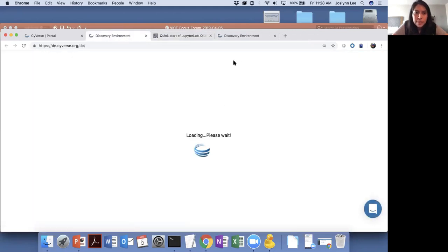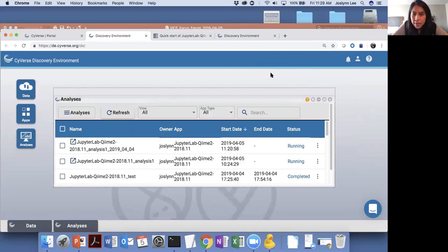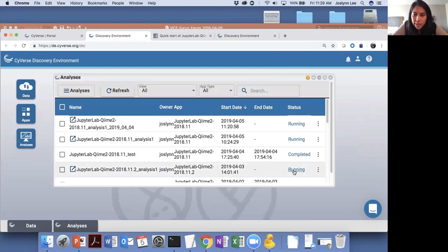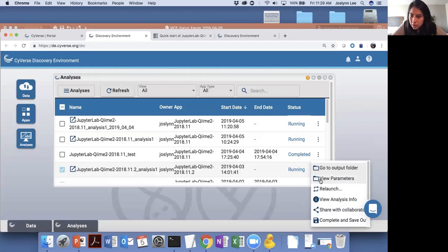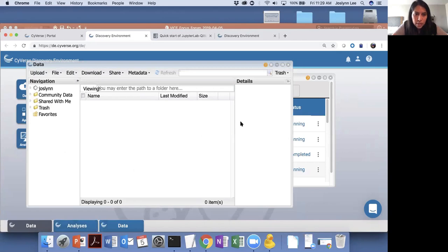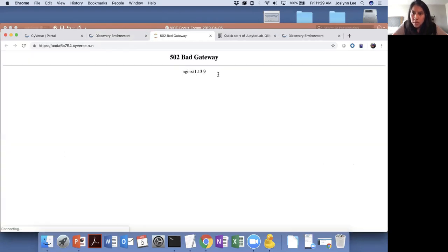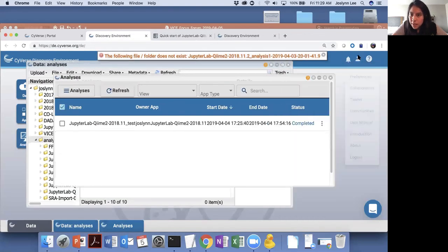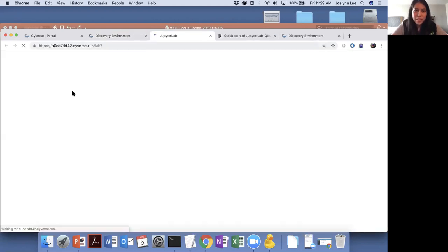I think I have a few too many of these Jupyter notebooks launched. Let me try one prime. Okay, so this refreshed. So I'm going to go back to an instance that was already running. So I'm going to click on that link. Which one is this? I think it should. No. That one. All right, so that plan backfired of having multiple Jupyter Labs running.